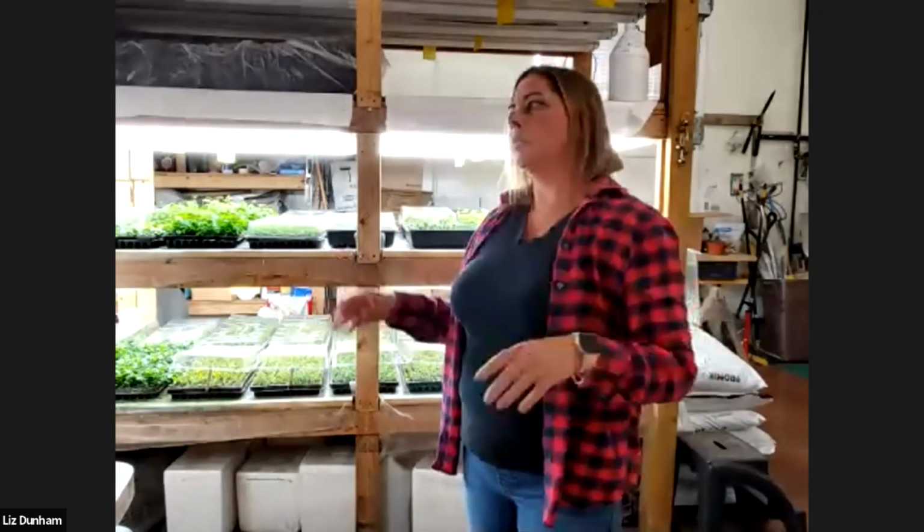Like I said, people are starting to take things a little later, but that's generally where the busy season for us is. So if you come in here in March, all of these benches will be completely lit. We can grow almost 100,000 plants in here. In the culture room, we can do 500,000 at a time. And you can turn those over every 3 weeks. In here, it takes about 6 weeks and we can turn them over.